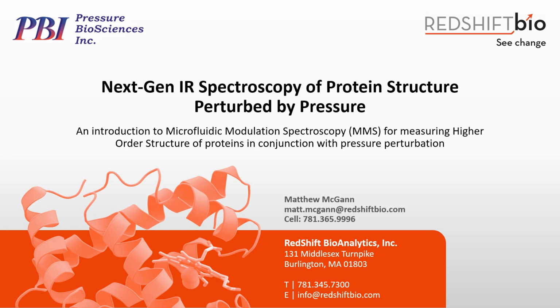Today's webinar is going to be focused on the next generation IR spectroscopy of protein structure perturbed by pressure. And this morning I'm going to introduce to you microfluidic modulation spectroscopy as a tool for measuring higher order structure of proteins in conjunction with pressure perturbation.